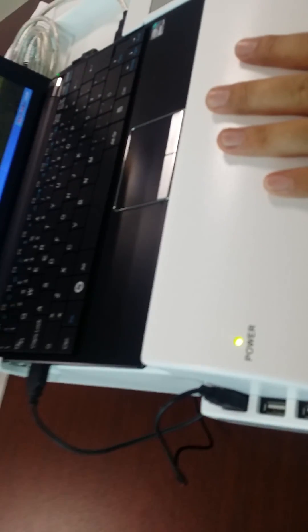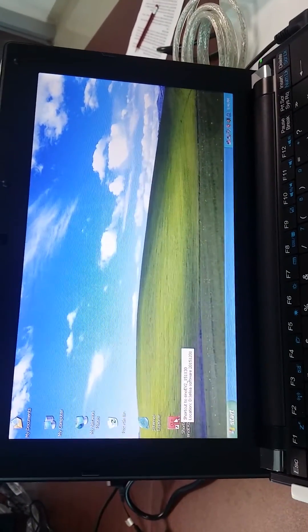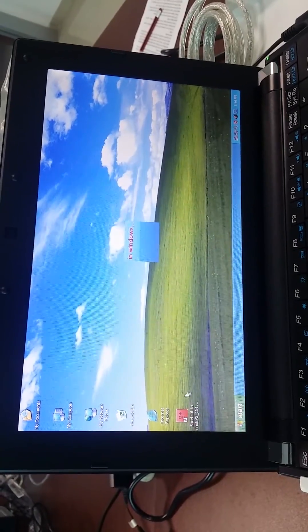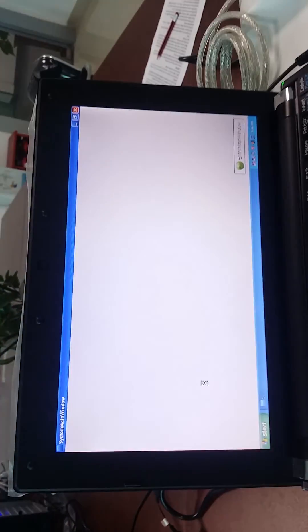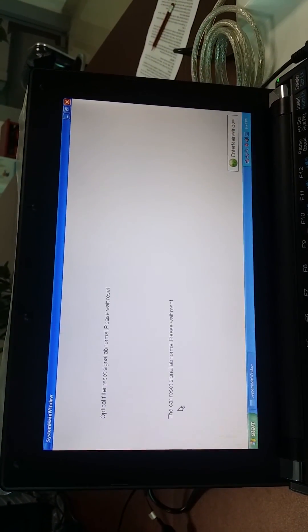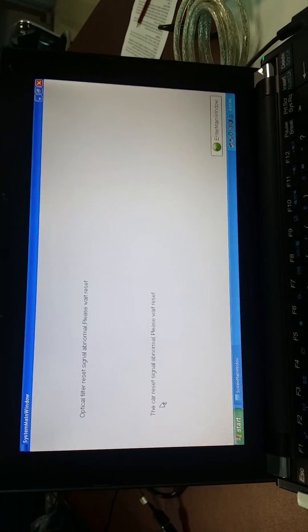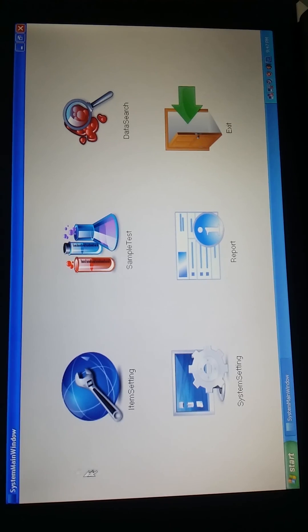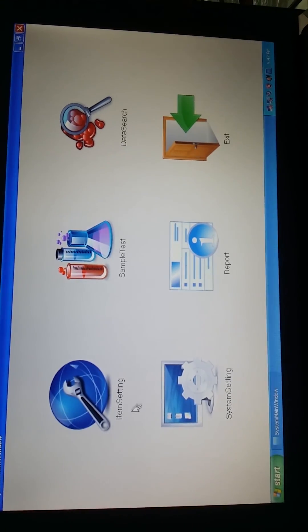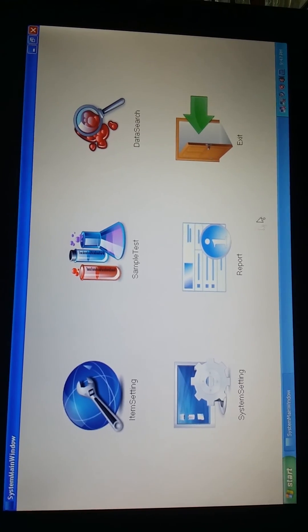The machine will check itself automatically. Now just double-click the software and it will run automatically. Now we get the software interface, and you will find there are several items: item settings, sample testing, data search, system settings, report, and exit.